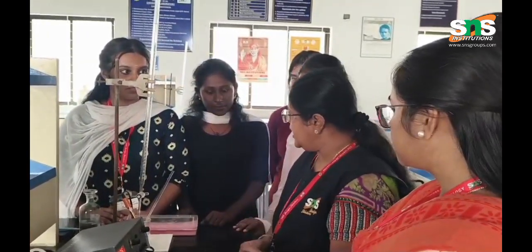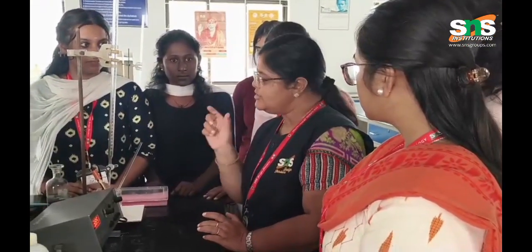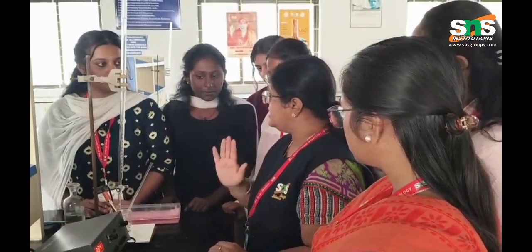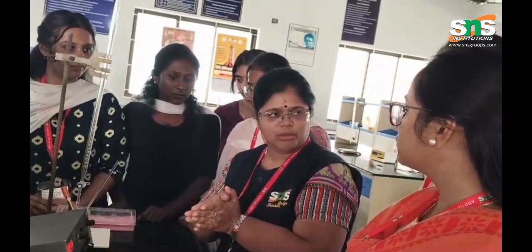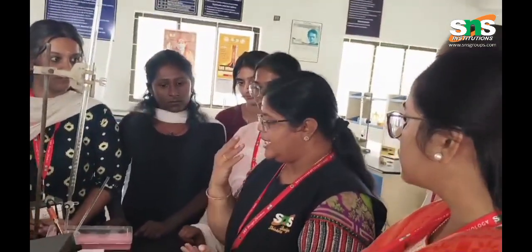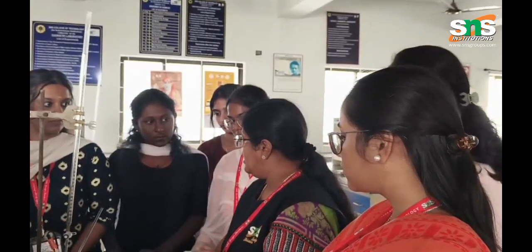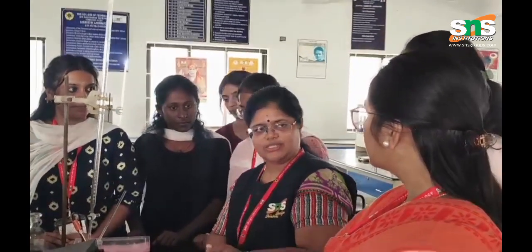So this is about the conductometric titration of a mixture of acids. You have to plot a graph with the volume of sodium hydroxide along the x-axis and the conductance value along the y-axis. You will first get a decreasing value, then a slight increase, then a sudden increase. Join the points that fall in a line and intersect them to find the volume at the neutralization point for the strong acid and the weak acid. From there, do the calculation using the volumetric method, V1N1 equals V2N2. Okay students, thank you.